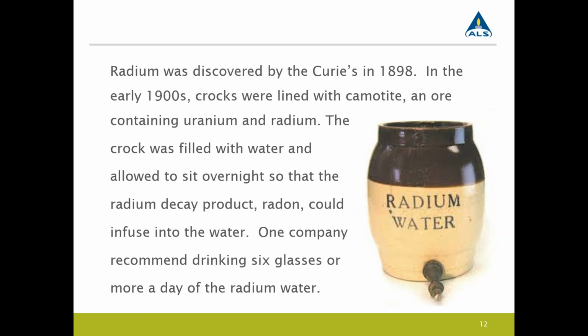For produced waters, we typically do use the alpha scintillation technique. Method 903.1, people may be more familiar with it under that terminology. And that's because you are doing a chemical separation on the isotope, and it has a carrier that goes along with the analysis, a barium carrier. And carriers act like surrogates when you're doing a semi-volatile or volatile type analysis. So it helps as an additional method control. And you don't have that with gamma spec. You do get that with the alpha scintillation and again with the gas flow proportional counting.